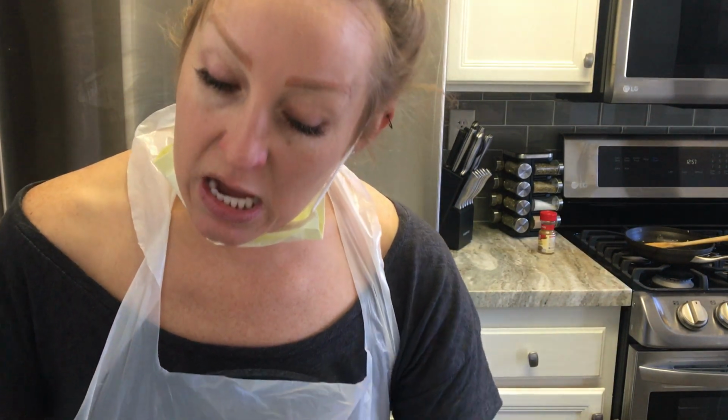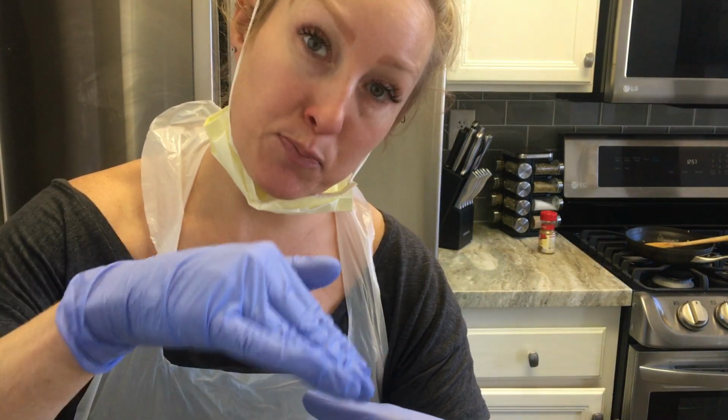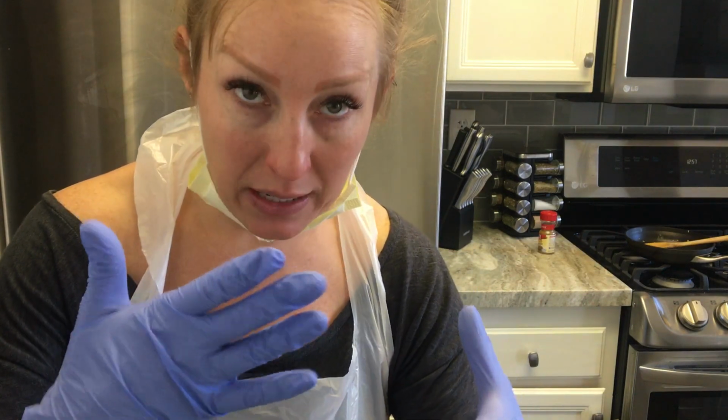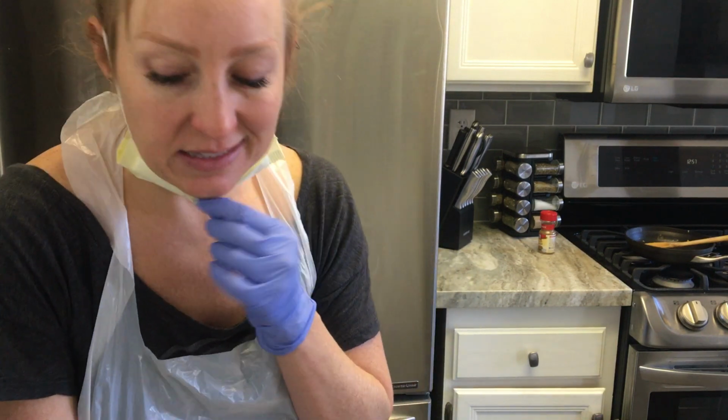Now, I have to write up 2 errors in my paper. Number 1, which may or may not have affected things, is that my agar plate is uneven and it also has bubbles. I'm thinking that the S. epidermidis broth maybe was uneven, and so it didn't spread evenly, which can influence the antibiotic disc. But number 2, I think there is a contaminant. And why do I say this? Well, I'm going to show you why.